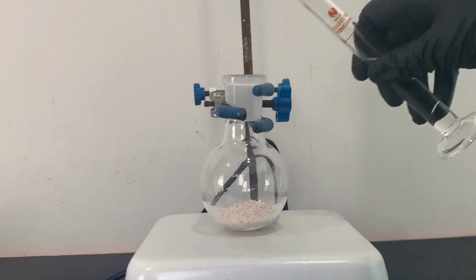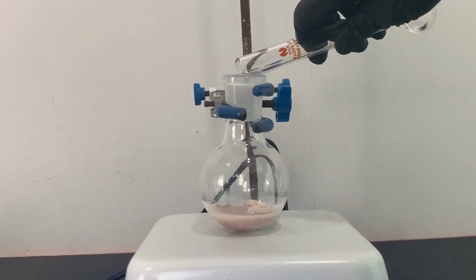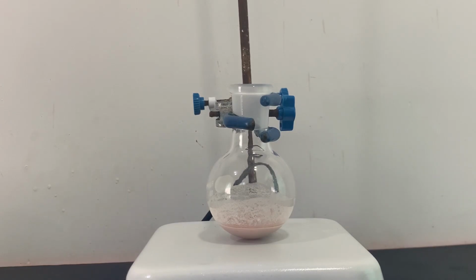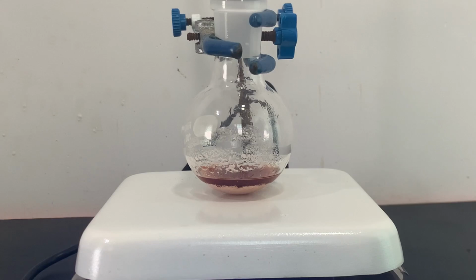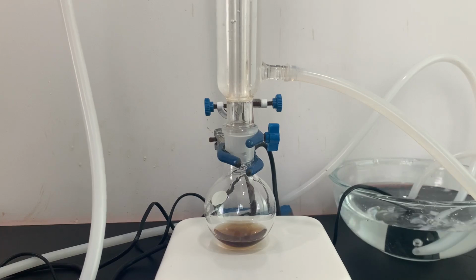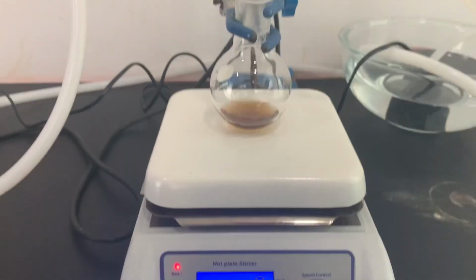I then poured in 7.5 milliliters of acetic anhydride. I turned on the hot plate and started to heat the flask. After heating for a bit, the anthranilic acid will start to dissolve and eventually form a clear solution with the acetic anhydride. I connected a condenser to the flask and started refluxing the solution for 10 minutes.